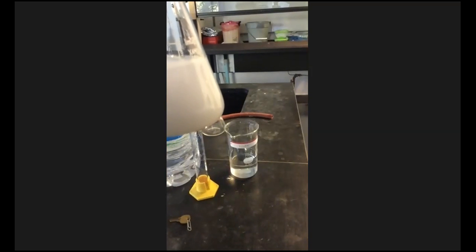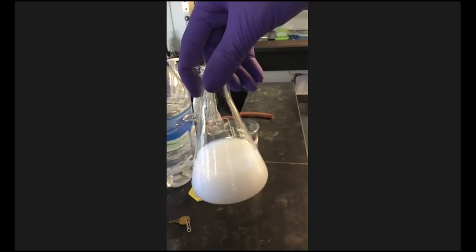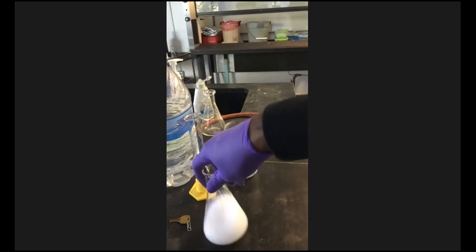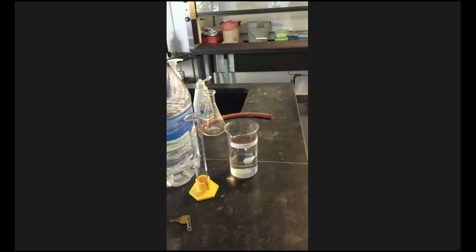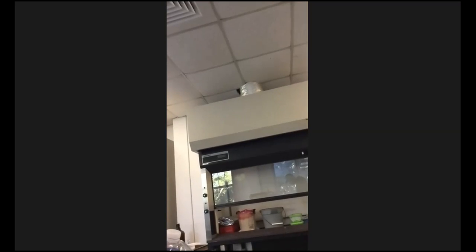You can see it's all milky, right? Which is what you expect, because when you add these two together, the calcium oxalate that you get is insoluble. It's an insoluble solid. So there's a lot of calcium oxalate floating around in here, but we want to isolate it. So we're going to mix it, and then we're going to digest it. Let me see if I can see it at the bottom. Try to turn the light on so I can see it. All right. I want to show you this if I can get the camera angle right. Can you see at the bottom of this flask?